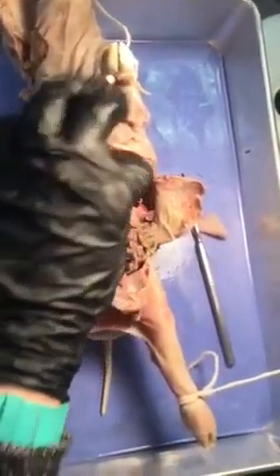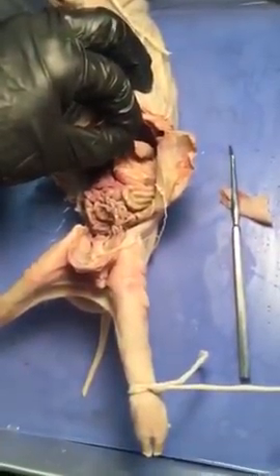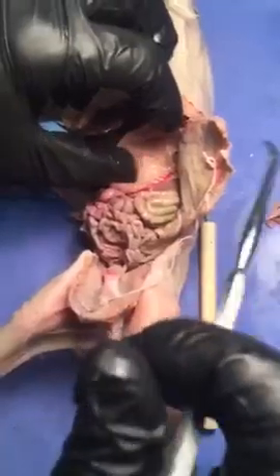Now, what do we call the folds in an undistended stomach? The inside is folded. What do we call the folds? Those are called the rugae. When the stomach's full, they stretch out, they go away. Remember, that's different than the folds that we see in the intestine that never go away. Rugae? It should be on the list. R-U-G-A-E. Just one G. If it's not on our list, we need to add it now?